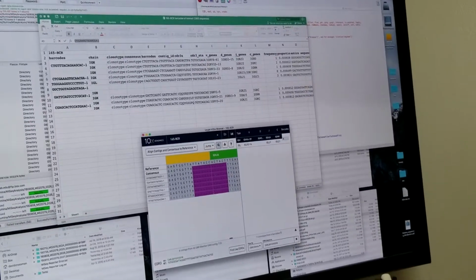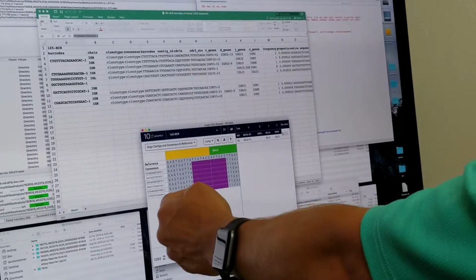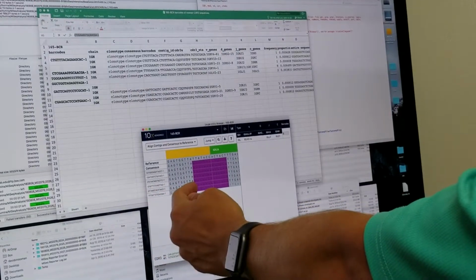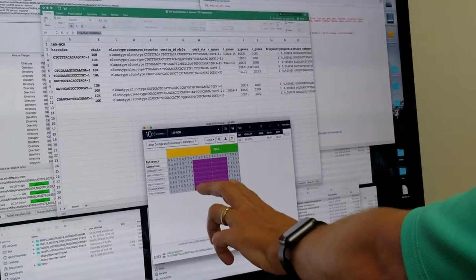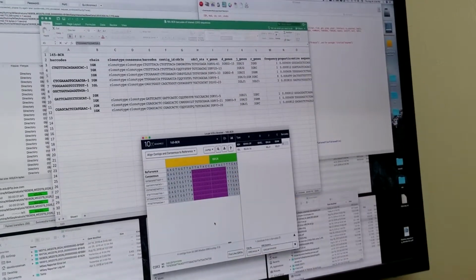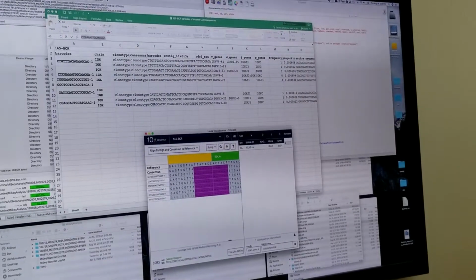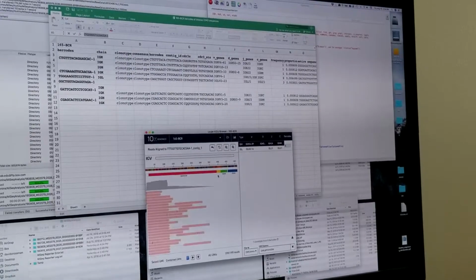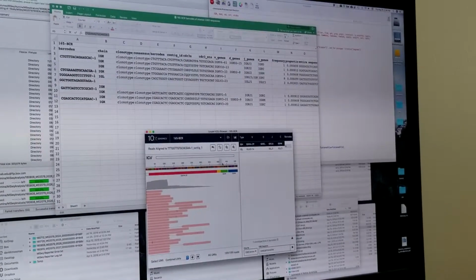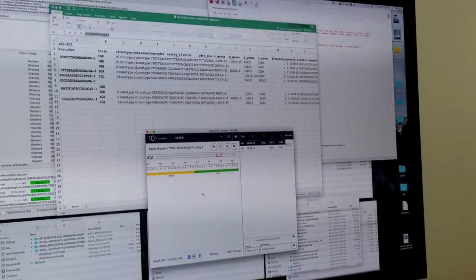Well, yeah, majority of the times, if it shows a deletion, the read has these sequences, and then the read picks back up at this, and it doesn't have these bases inside of it. So there's an actual complete deletion. Like you said, the ones at the beginning and end are not. But is that in the middle of a lot of them? See, the mutation was near the end. I don't think it's showing the mutation in this report.